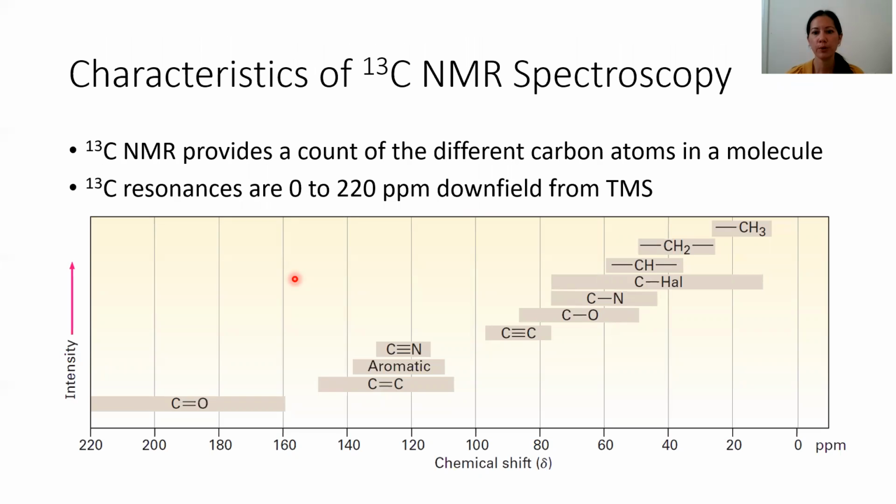What you need to be able to do is read a carbon-13 spectrum that goes from 0 to about 220 and know where the peaks reside and the types of peaks. In this more downfield region, 160 to 220, that's where your carbonyl carbon signal comes up. This is huge for you because if you're given just spectral data or even a formula, knowing whether or not you have a carbonyl group will greatly help you figure out the structure. You can also confirm that with IR. Most of those carbonyl stretches are in the 1700 wave number region.